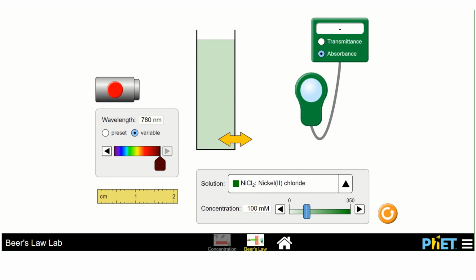I need to be more specific. The absorbance. Wow. Hopefully you're laughing at me. But you were adjusting, again, wavelength, measuring the absorbance. Those were the 2 things you were looking at in part 1. Part 2 is where we're starting to visit concentration changes, okay? And that's where Beer's law comes into play.